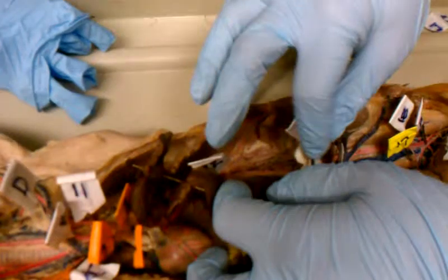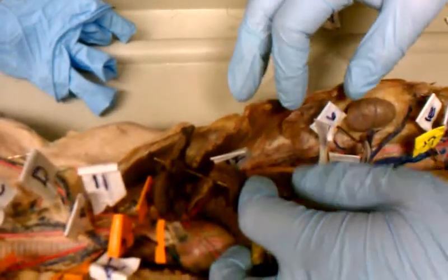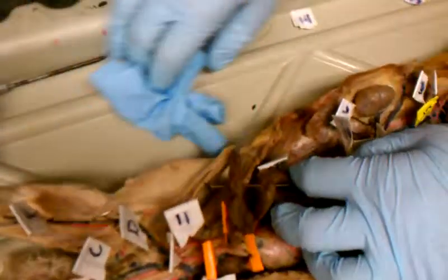Descending aorta, and then the first one to come off the descending aorta is the celiac trunk. Give me a probe. There's one right there. I don't want to touch it. Sticky one. Yeah.